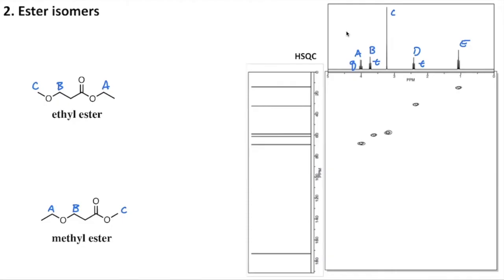Now that could be a lot of other different types of protons, but it might be a good thing to have in the back of your mind for this current unit that we're in. So based on that, the remaining choices are that set of hydrogens here or the methyl group hydrogens, right? In either case, they're going to have the same splitting because A has 2 hydrogens on it here and B has 2 hydrogens on it here. So either of those groups will be split into triplets.